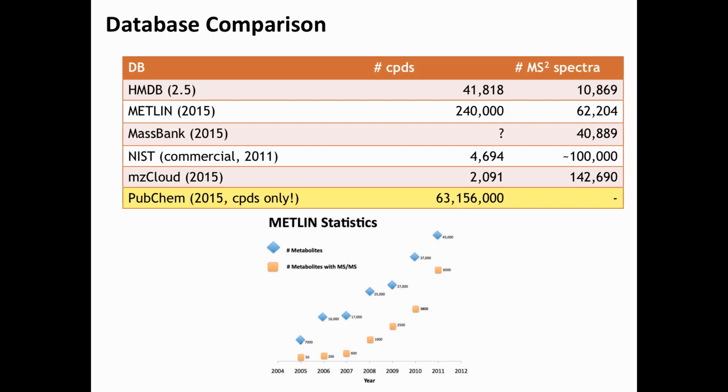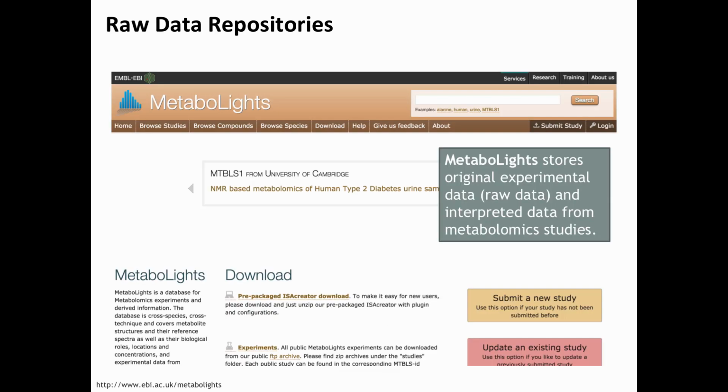First of all, it is essential for reproducibility. If you really want people to believe what you published, then you should get your primary data out there. And that means upload all your spectra. Please do not just add a supplementary material, an Excel spreadsheet that contains some identification that you believe to be right. Please upload all your primary data.